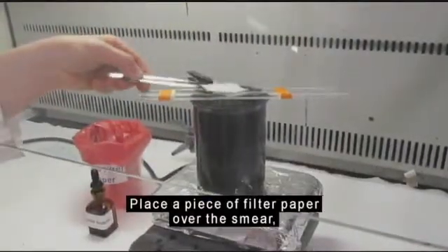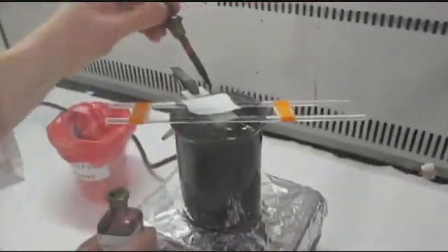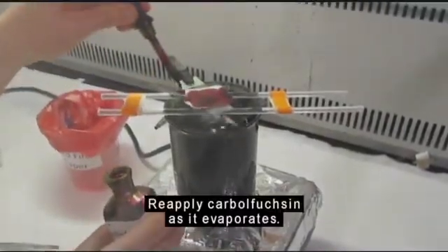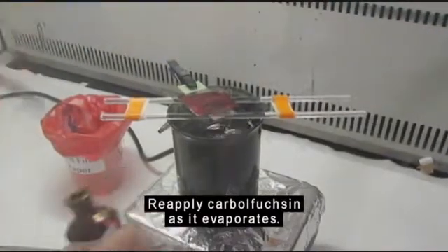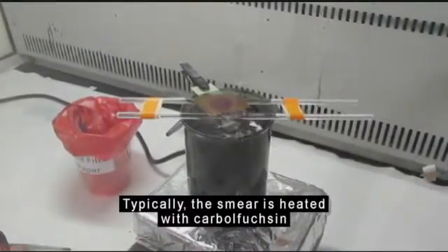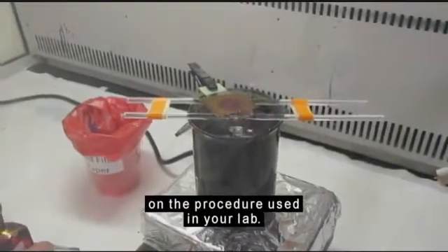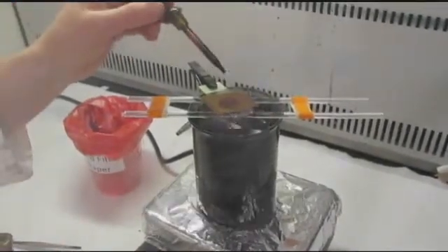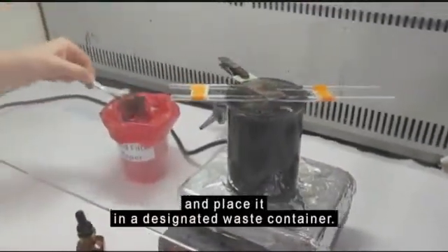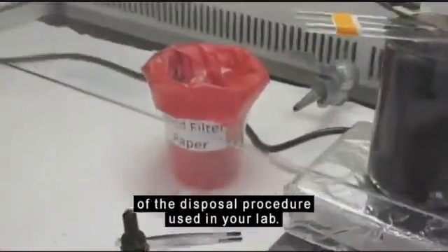Place a piece of filter paper over the smear and saturate the paper with carbolfuchsin. Reapply carbolfuchsin as it evaporates. The filter paper must stay wet throughout the procedure. Typically, the smear is heated with carbolfuchsin for 5 minutes. Your instructor will provide details on the procedure used in your lab. Carefully remove the filter paper with forceps and place it in a designated waste container. Your instructor will advise you of the disposal procedure used in your lab.